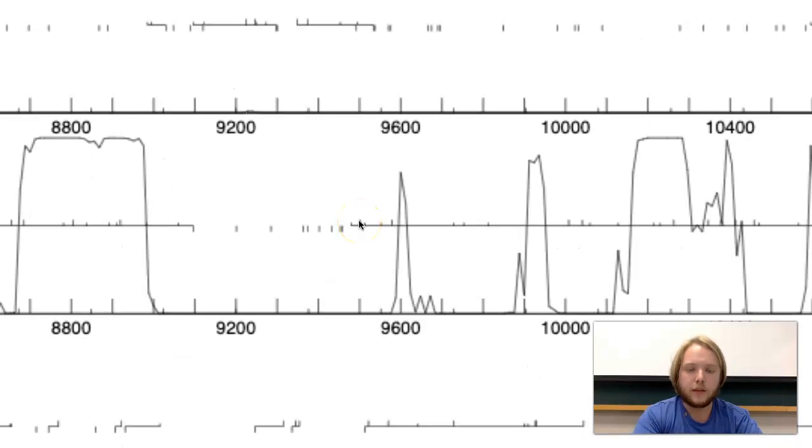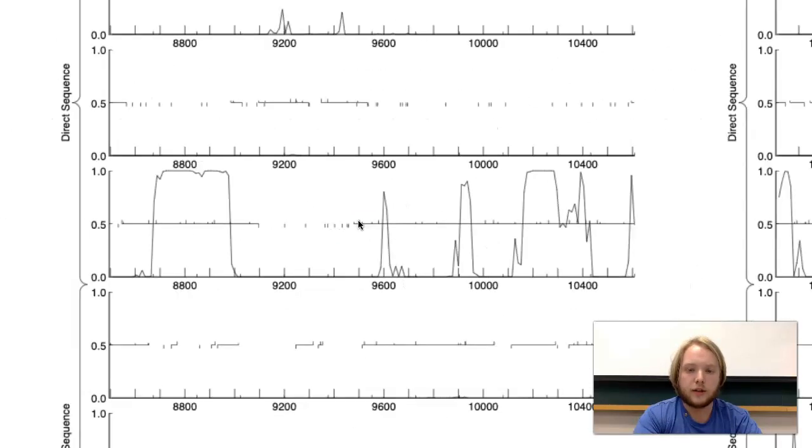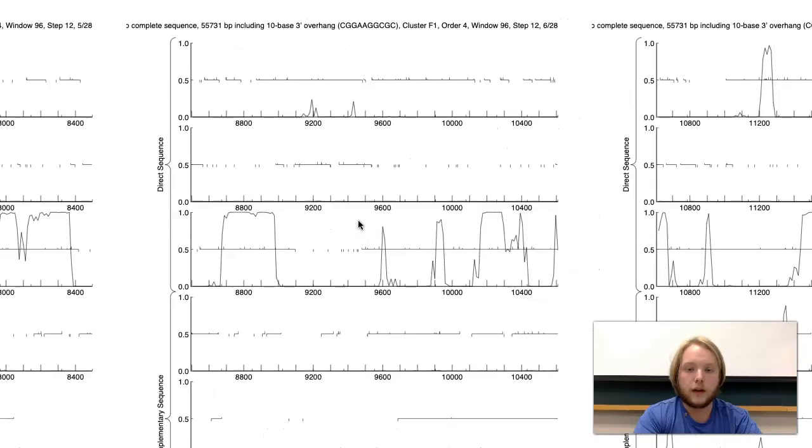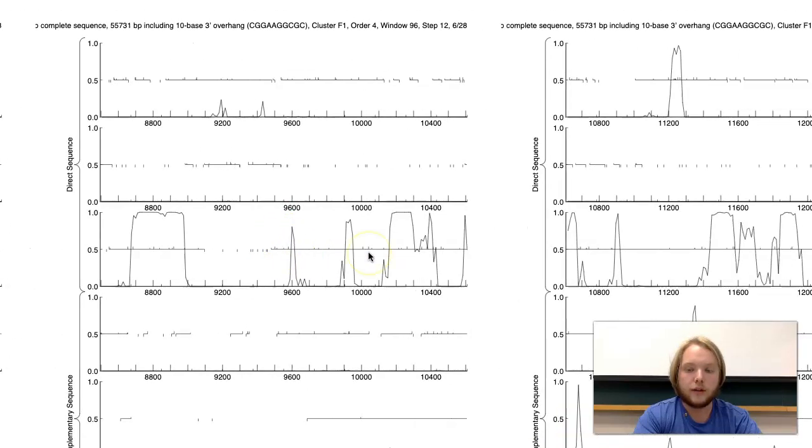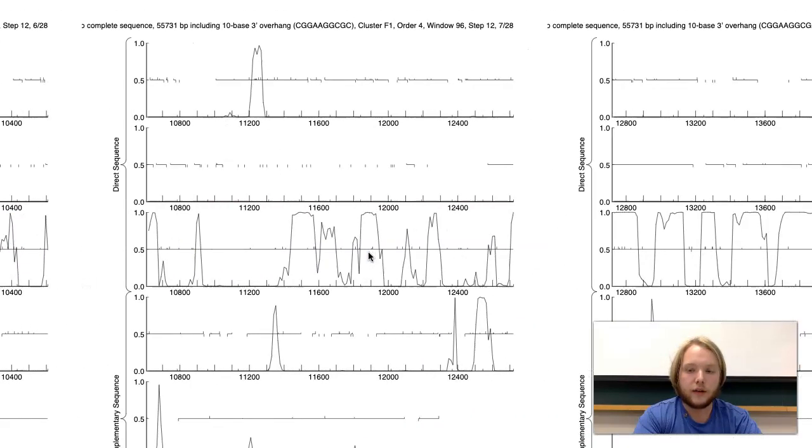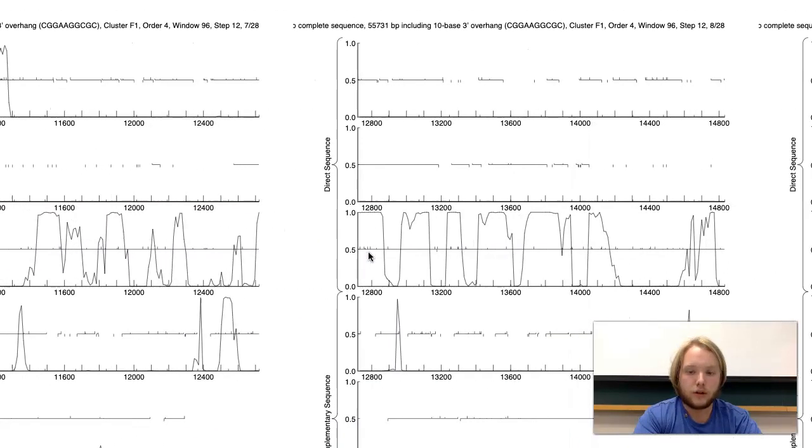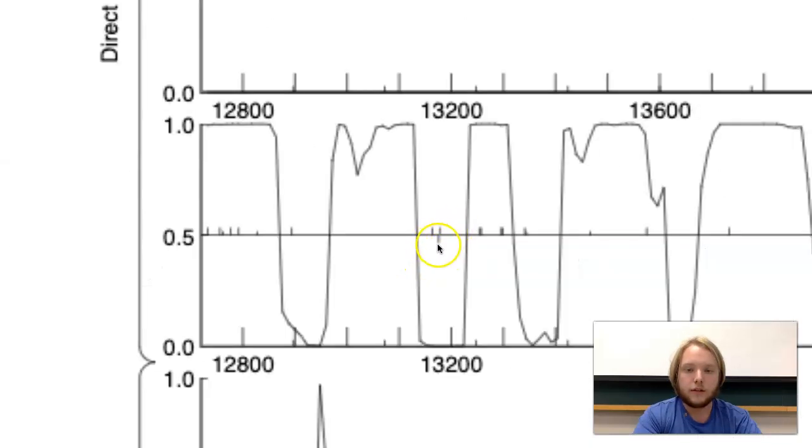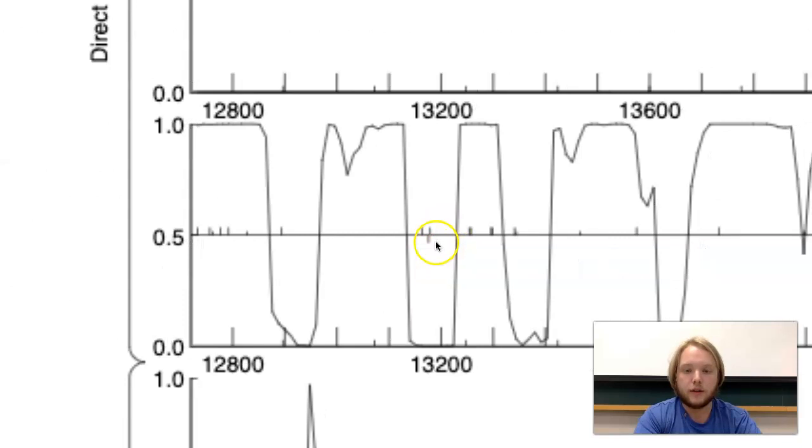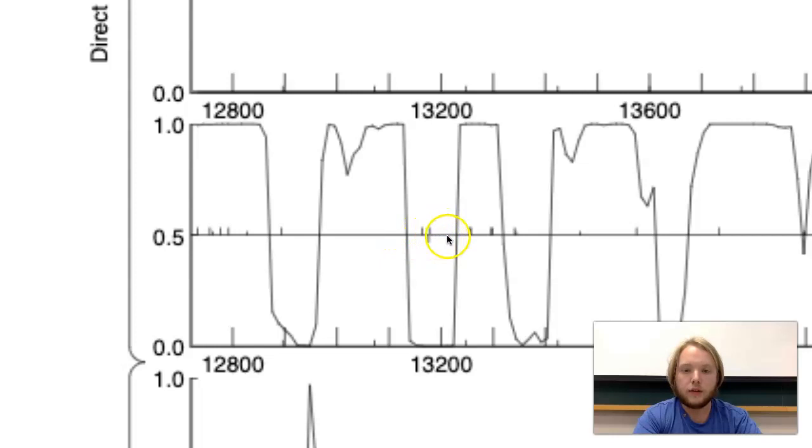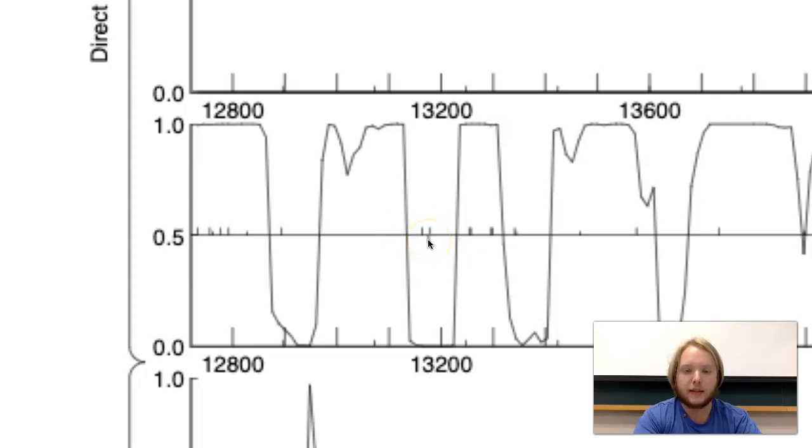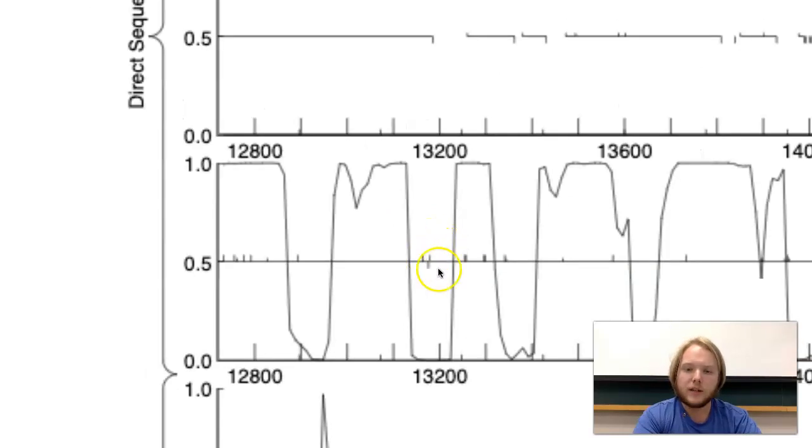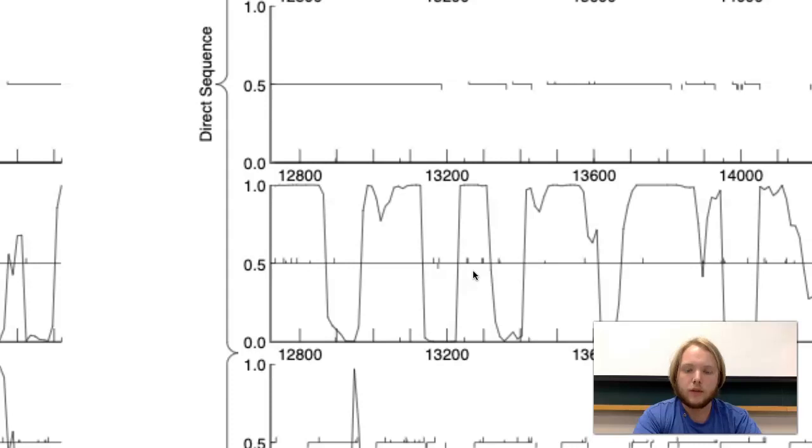Since this is the tape measure protein, it's the longest protein in the genome sequence. As such, it starts at 9,504 and continues all the way to 13,181. Here, there is a downtick. This downtick is immediately followed by an uptick, which means there is no gap between the tape measure protein and the following gene. Even though the line looks continuous, this is not all the same gene. The stop codon means a gene has to end. But why is the next gene right here instead of anywhere else?